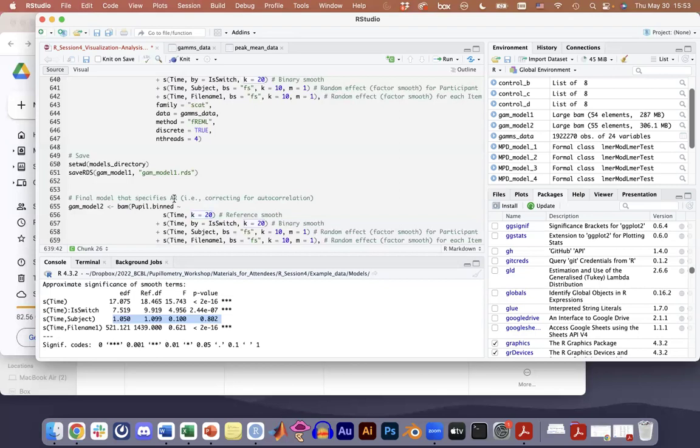The Van Rij paper goes through how to build your models if you're doing model comparisons, because the other thing about GAMs is you can build your models different ways to get to the same outcome. So you have to choose how to code your data, just like you do for any regression analysis, but definitely look at their paper for the exact rules of how to do it.